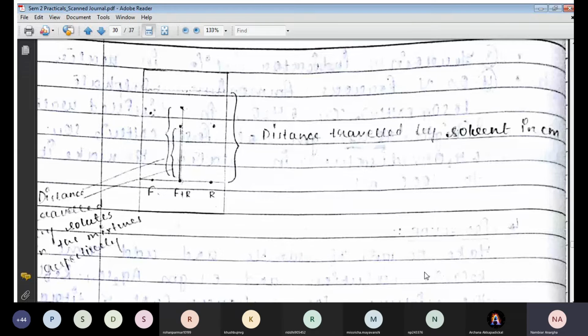हाँ ठीक है. यहाँ अच्छा, स्टैंडर्ड फ्लोरेसेंट के स्पॉट, हाँ दिख रहा है, गुड. स्टैंडर्ड फ्लोरेसेंट पे लेके जाना, स्पॉट जो सेपरेटेड है ऊपर जो रन हुआ है वो दिखा ना. हाँ, there you can see that is for standard. मिक्सचर में फ्लोरेसेंट दिखा, मिक्सचर में, यस.